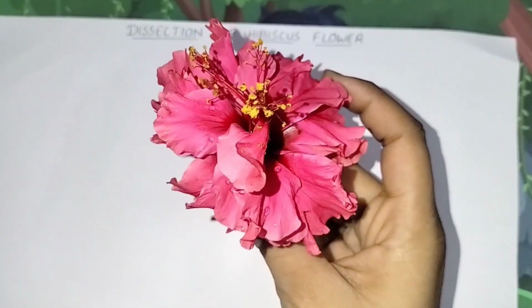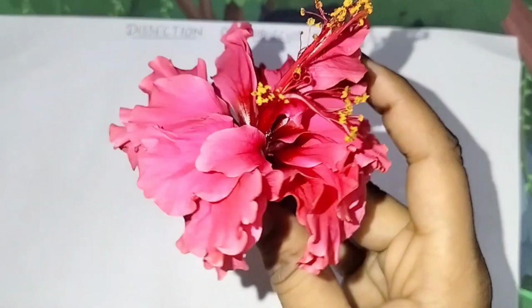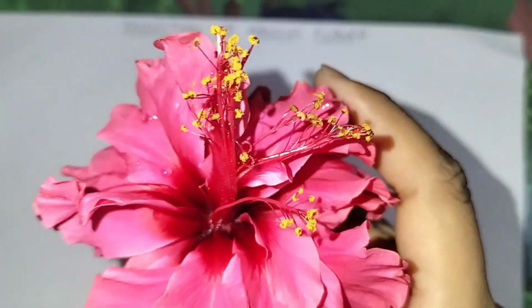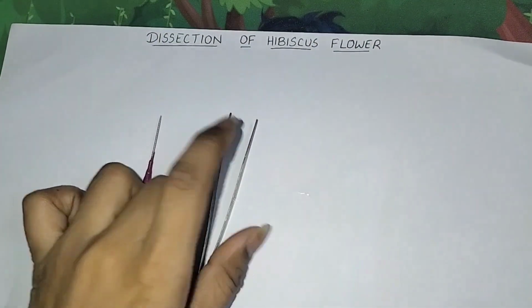Everyone must have seen a hibiscus flower. Right? So this is known as hibiscus flower and we are going to dissect it with the help of a needle and forceps.